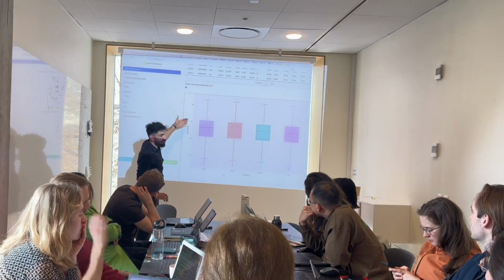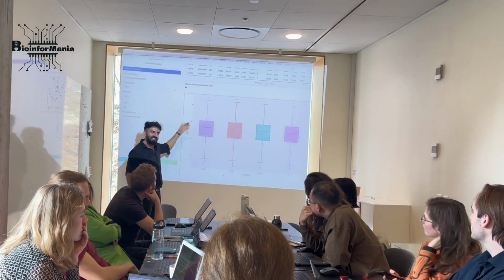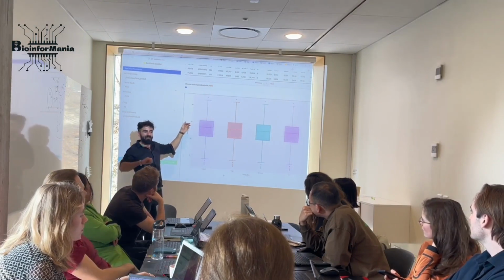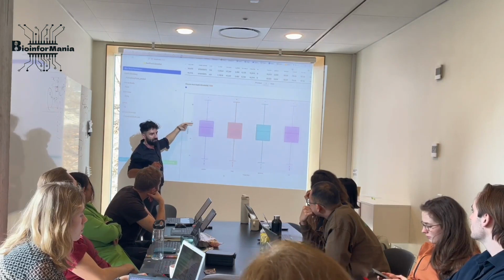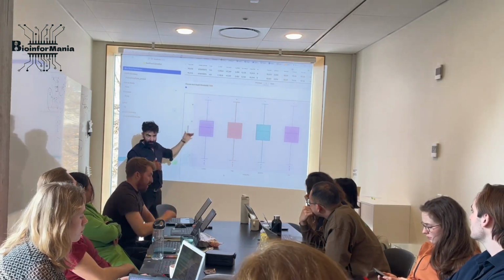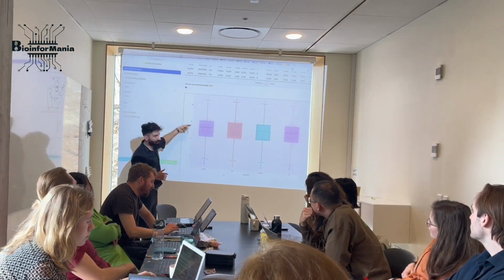But you can see this is Oxford Nanopore Technology, and the mean quality is about 16. And you remember how we calculated the quality. For Illumina, it needs to be 30. For this, with the new flow cell that we have right now, which is good, they have improved it from around 7 to probably 16.